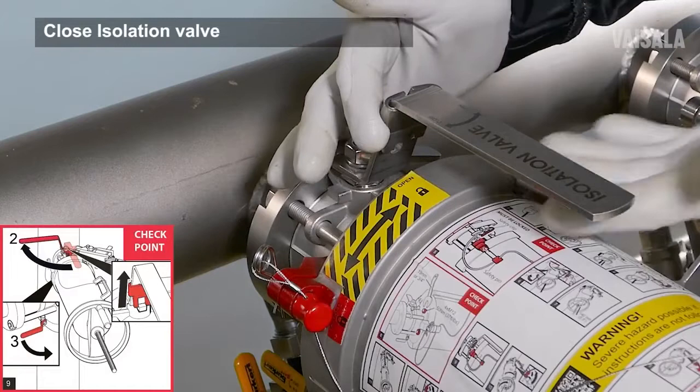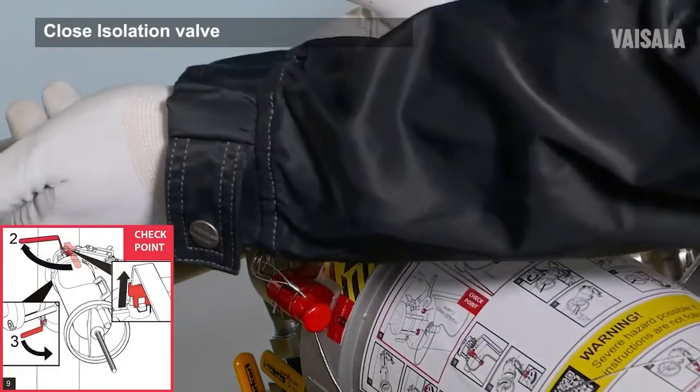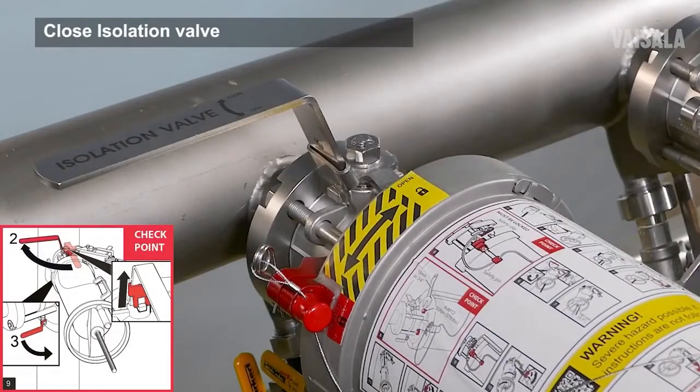Next, lift up the isolation valve handle locking plate. Close the isolation valve by turning the handle 90 degrees.